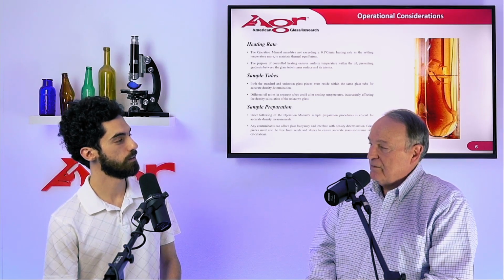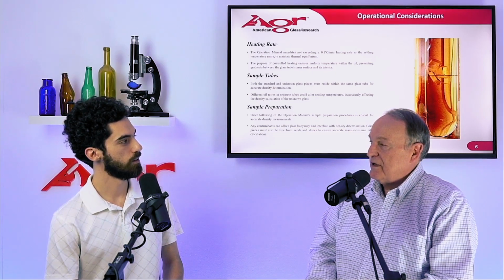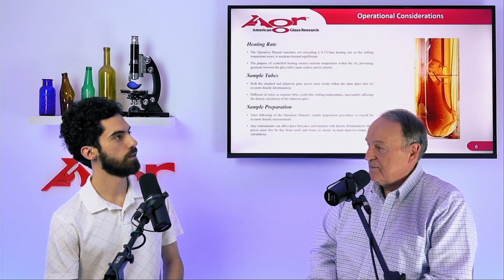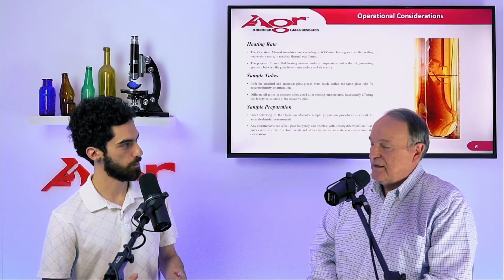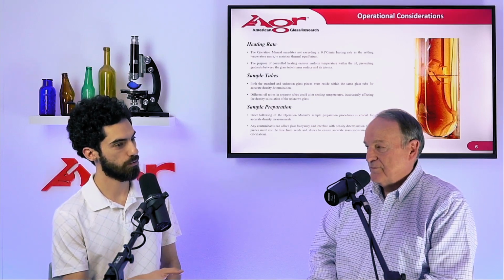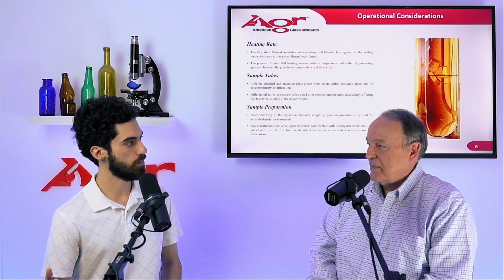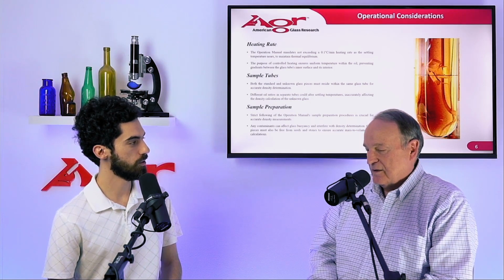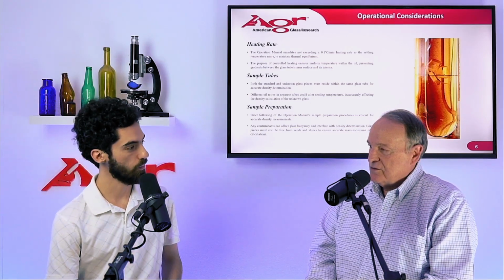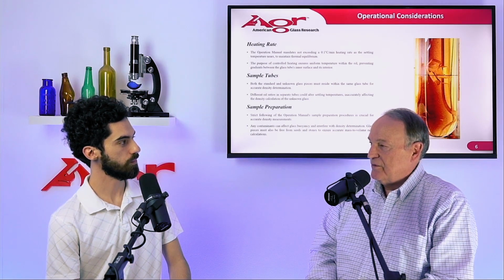That heating rate has been found through experimentation to assure good uniformity between the water bath and the oil temperature. So you're trying to get that equilibrium, with accurate results. If the oils are at a slightly different temperature than the water bath, it can cause problems. The main issue is you should assure that the oil is uniform in temperature across the diameter of the tube.